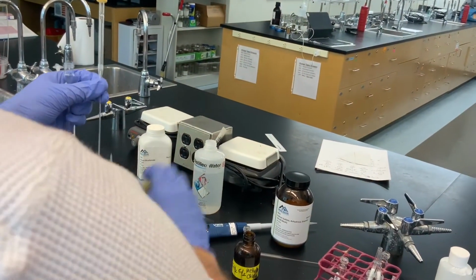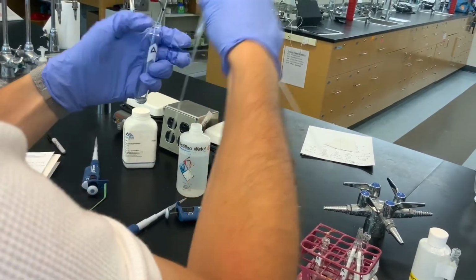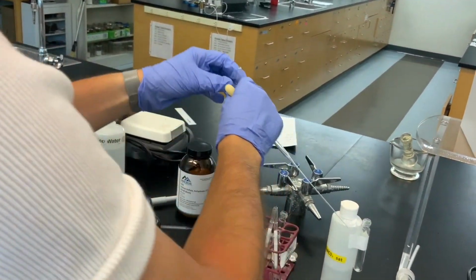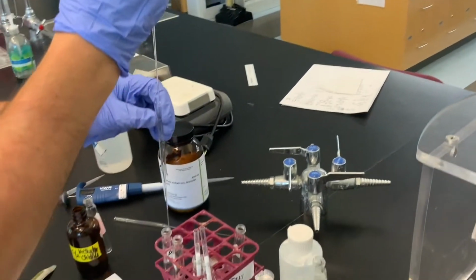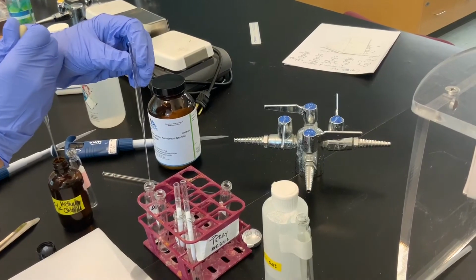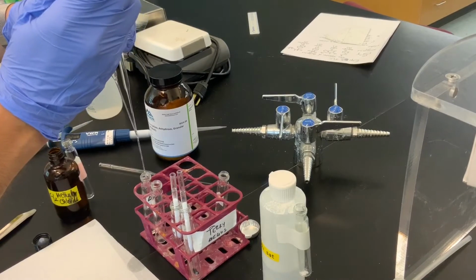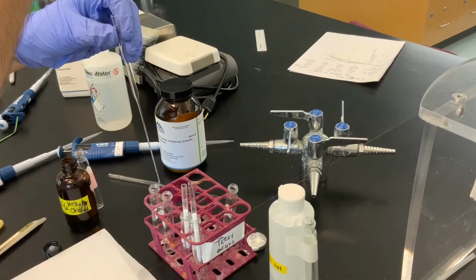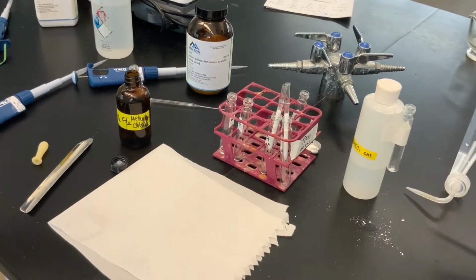So I'm just going to use a little bit of methylene chloride to rinse that. So I'm going to rinse the inside of the Pasteur pipette so as to get everything transferred over, and then also rinse the tip as well. So now we've got definitely a quantitative transfer there. All right, so this is part A's Pasteur pipette.